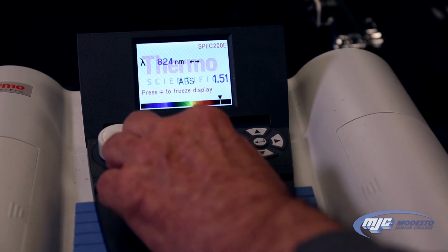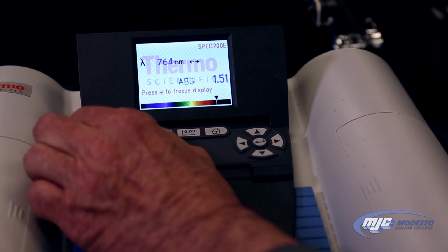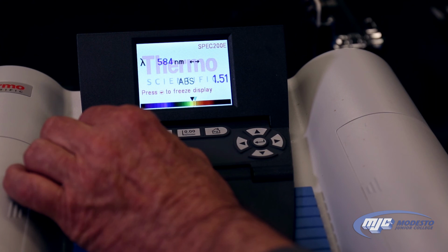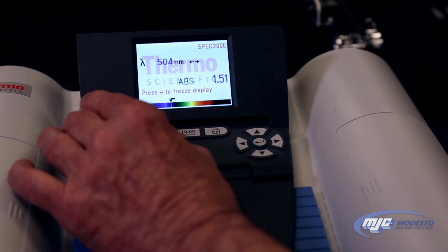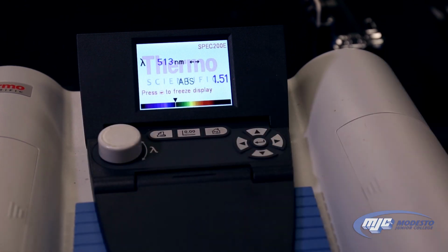So we change the wavelength until it's 513. 514, go down 1, give it a minute. And that absorbance there is the absorbance for solution 5 for cobalt. And all we do is we do the same thing for solutions 1, 2, 3, 4, and then the unknown.